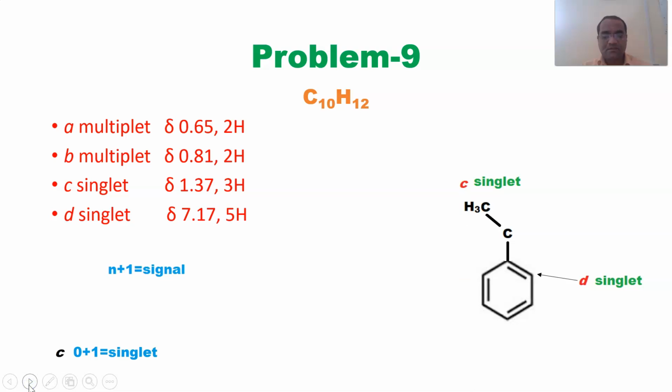Okay, so this is how the structure will be, and as the adjacent carbon does not have any hydrogen, I will not place anything over here. So let's see how the next signal can be. So I will put 2 hydrogens, and why have I written 2 carbons over here? You need to apply the logic of how it can be. 6 carbons have been consumed.